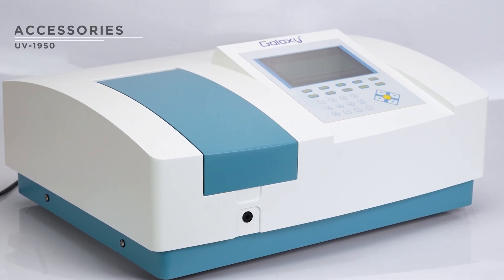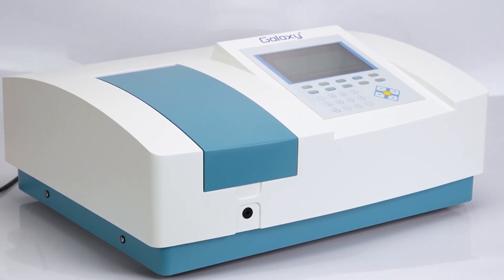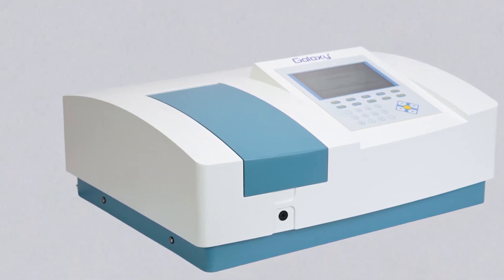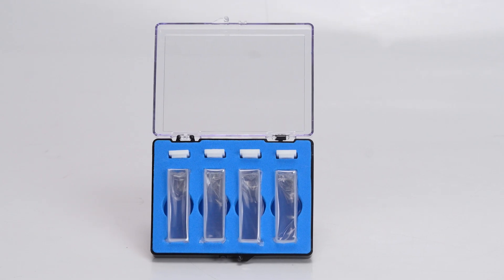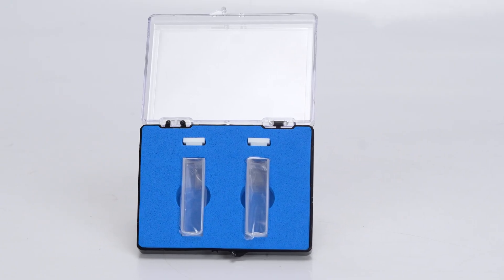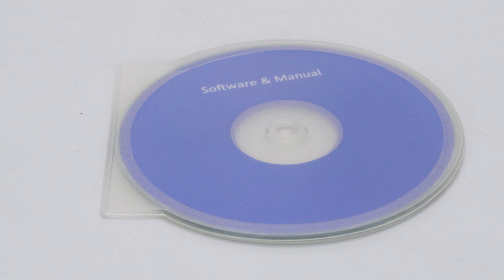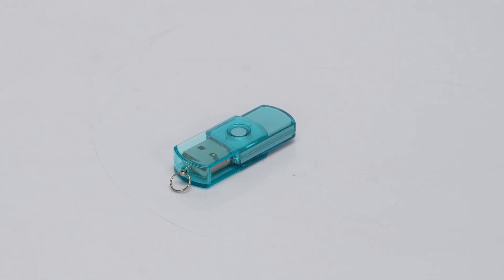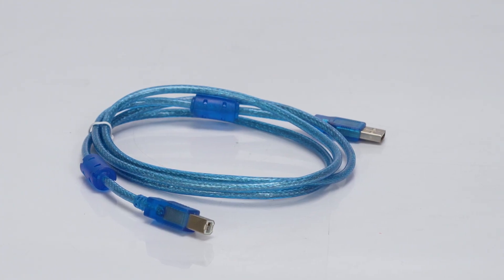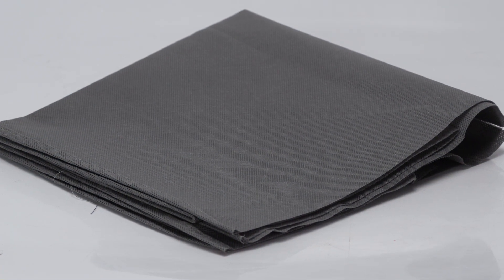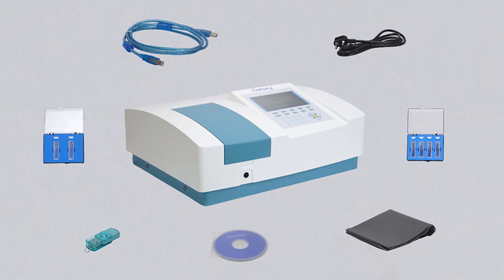When you unbox the UV1950, you'll find the following accessories: the main unit, power cable, four glass cuvettes, two quartz cuvettes, a compact disc with software, a dongle key, a connecting cable, and a protective cover. Ensure all components are present before starting.